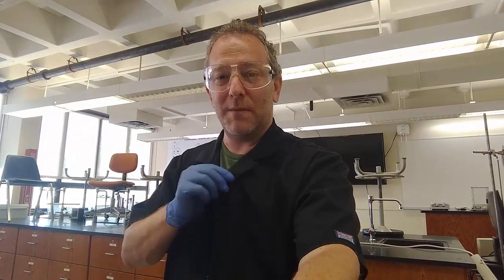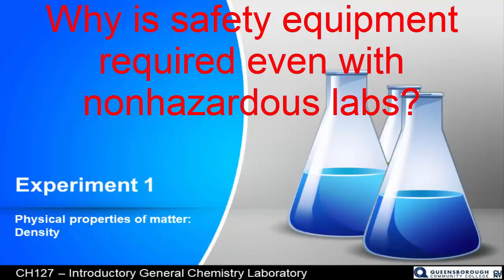Of course, I'm starting the lab wearing my goggles, wearing my lab coat, and wearing my gloves, even though nothing that we are using in this lab is toxic or hazardous. Why am I still wearing my goggles, my lab coat, and my gloves? Because establishing good habits is an important part of this lab, and an important part of an eventual job for you.